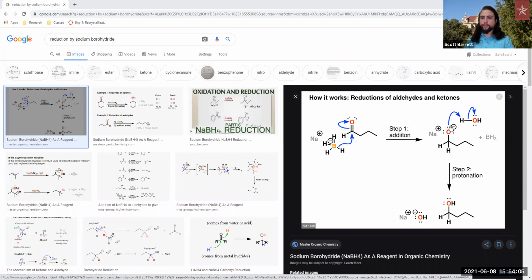Then we have our sodium alkoxide in a way, or in any way that we have an oxygen here with a negative charge, it can go ahead and bind to a local hydrogen on a water group within our system.